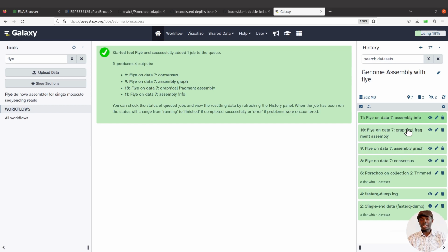It can also help you to identify possible issues. So basically what I'll say is that visualizing the assembly graphs can serve as a quality control. It can help you to evaluate the assemblies and get more information, which can be useful if you are interpreting your data. That's what I'll say for now. For the visualization of the assembly graphs, you can use tools like Bandage, and of course, I have tutorials on that. So check the description box, you'll find links to those videos.